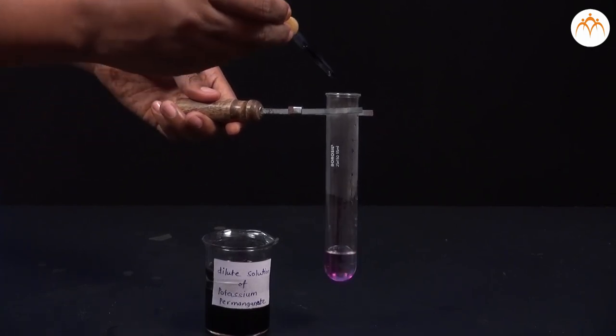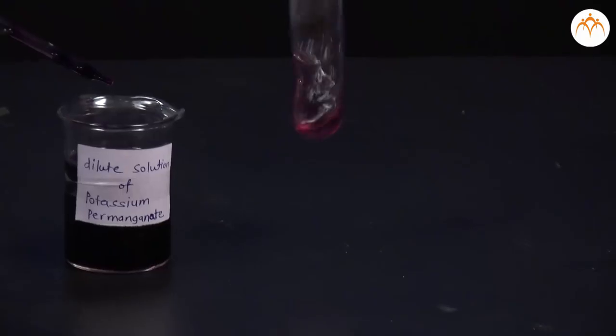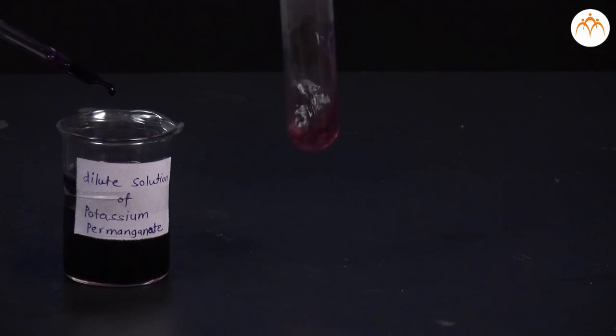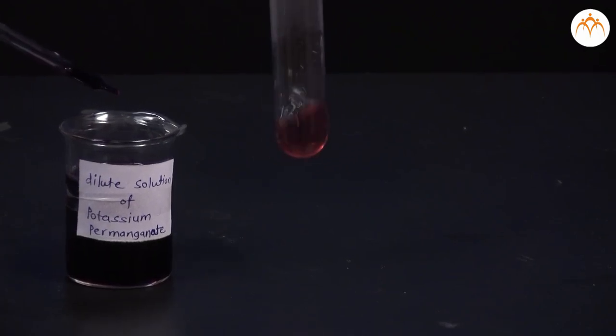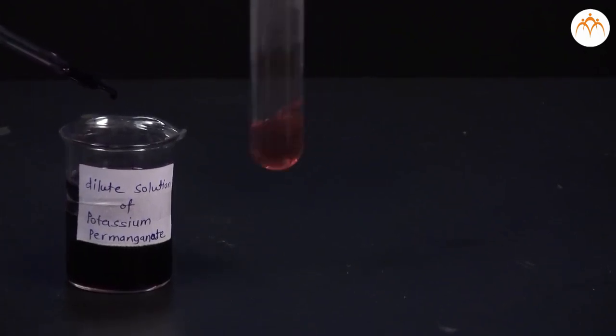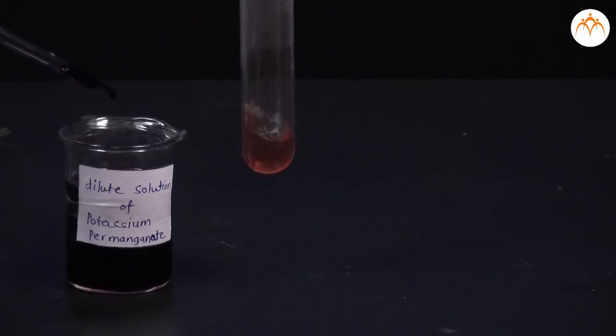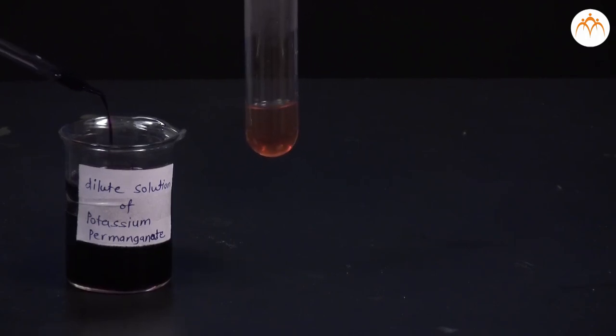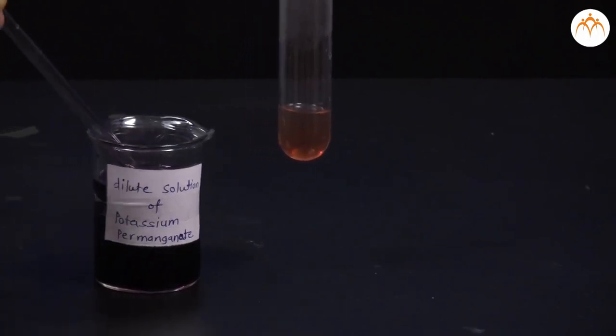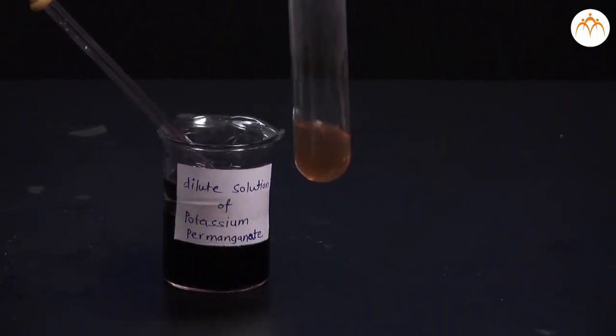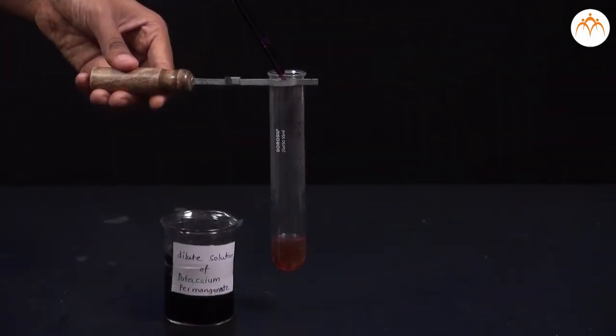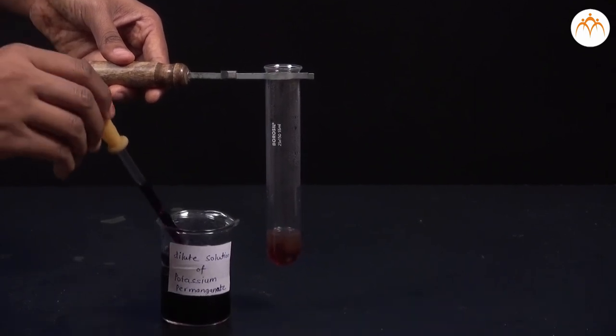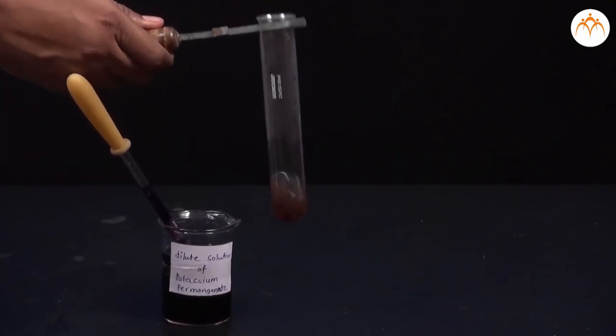We add potassium permanganate drop by drop, keep stirring it continuously. We will observe changes in the pink color. Initially the pink color disappears, but when we continue adding potassium permanganate further, the pink color does not vanish but stays there.